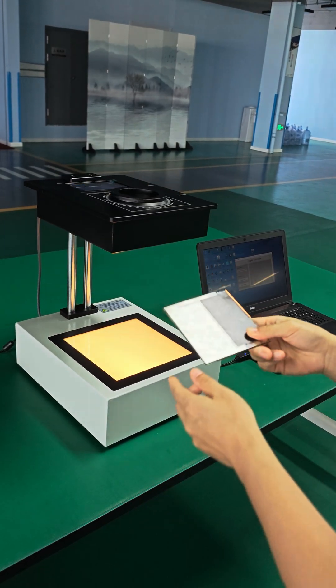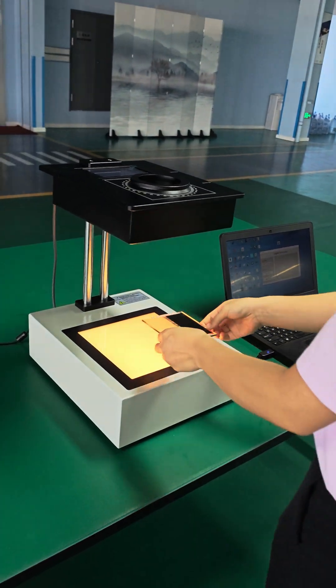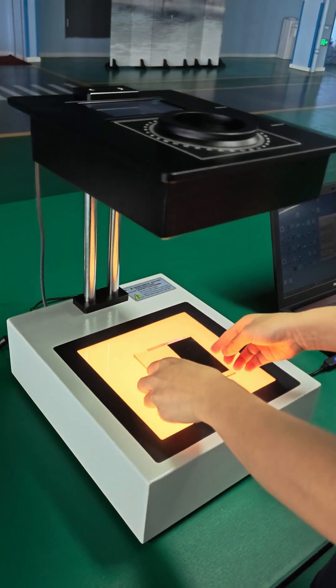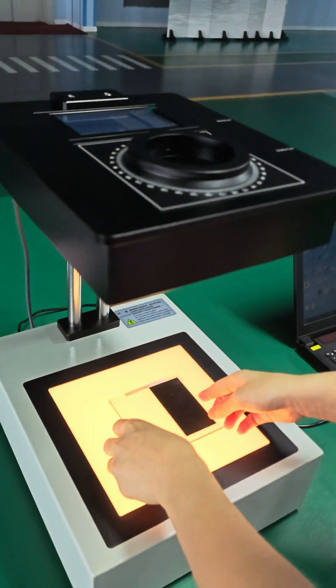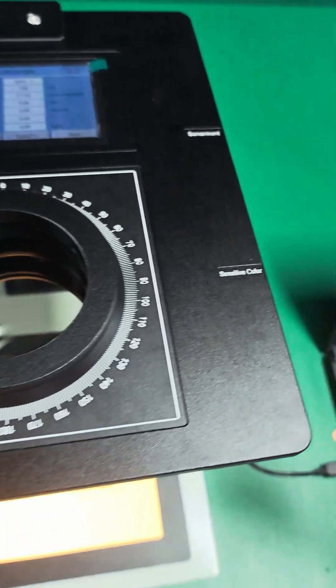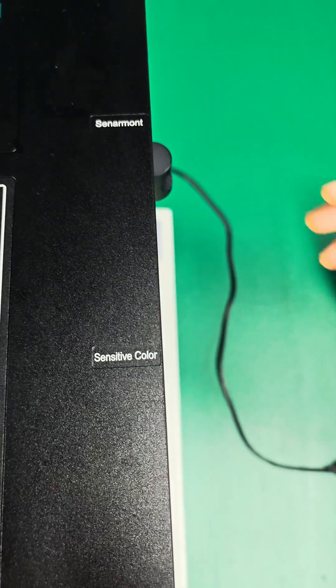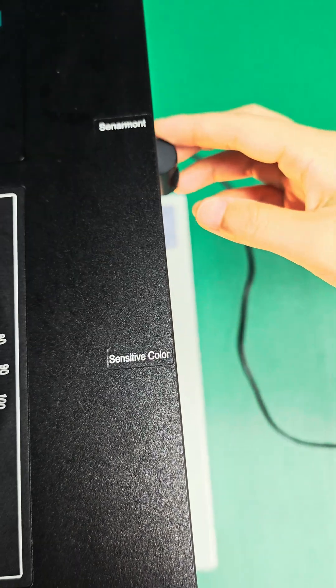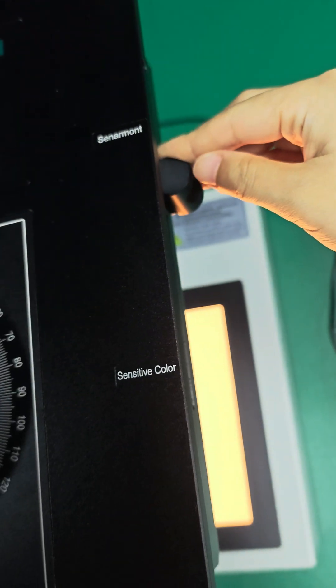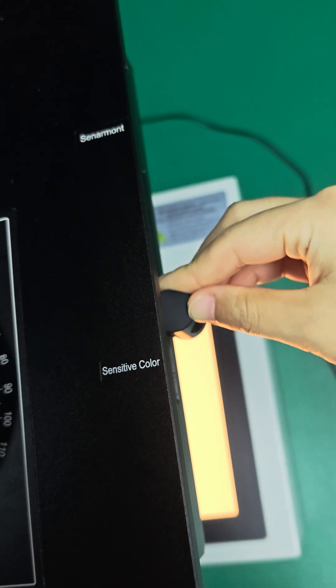Firstly, put the sample here. Then, pour the selected rod to the sensitive color method.